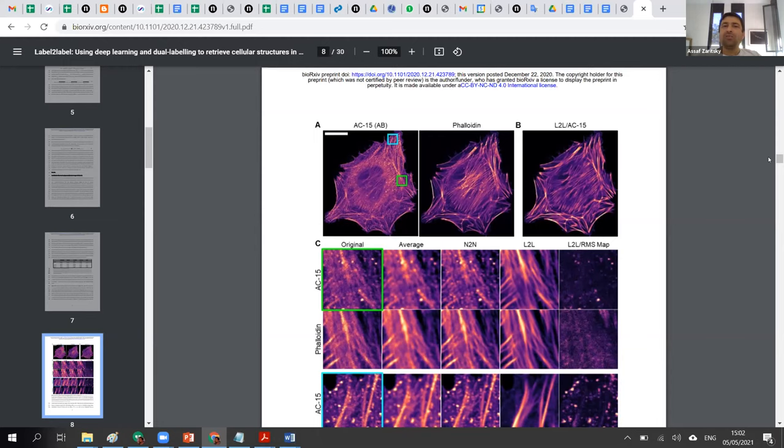So what they say here is, we're going to take two fluorescent channels, so we're going to label with two different fluorescent antibodies, let's say. Each of them has its own noisy patterns that are not specific, but they have the specific patterns in both of them. Now if we learn the transformation from one to the next, we're basically going to focus on what is real, what is common to these two images, and ignore all the, it's not noise here, it's non-specific fluorescence, right?